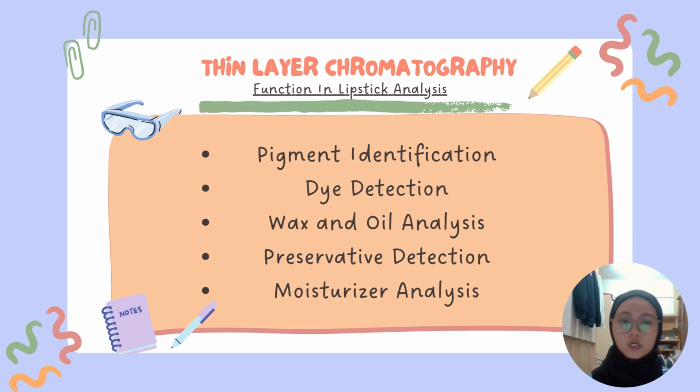Thin layer chromatography can analyze the types and amounts of wax, such as beeswax and carnauba wax, and the amounts of oils like coconut oil and lanolin that are used in lipsticks, which affect their texture and consistency.